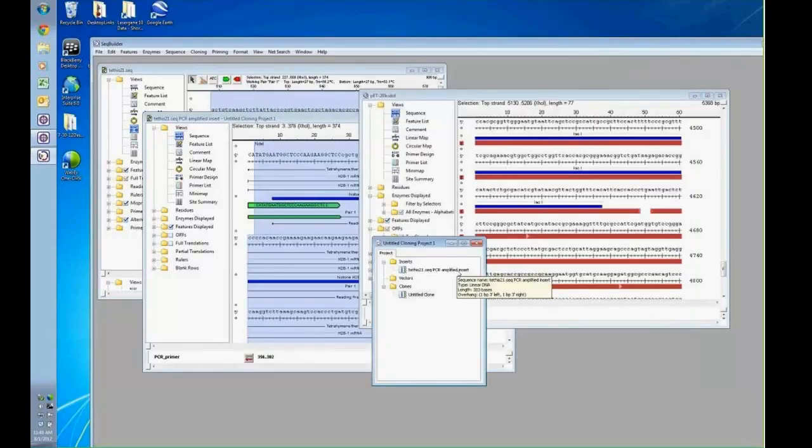Great, thank you. And then a question about primers. It looked like when you were creating the primers for your target sequence, you used the default options, and that created one set of primers. Is that the best pair, and is there a way to create more pairs, or can you just explain those options a little bit? Oh, sure.